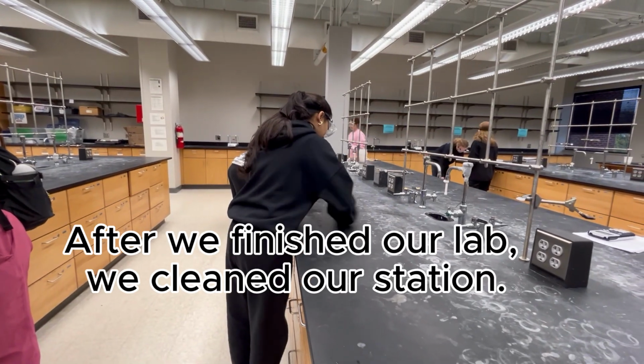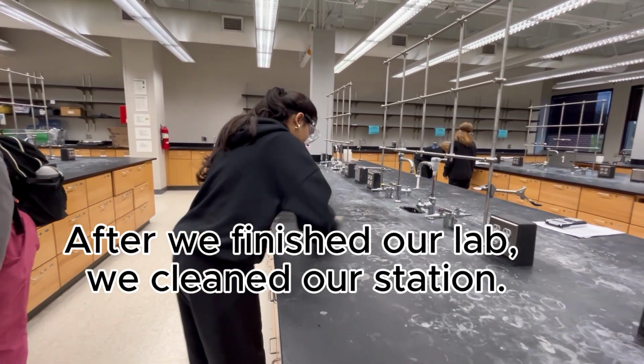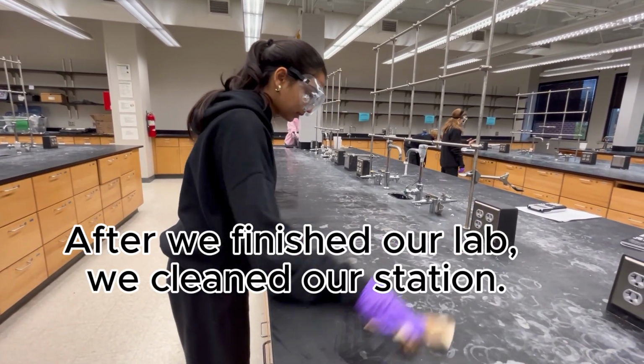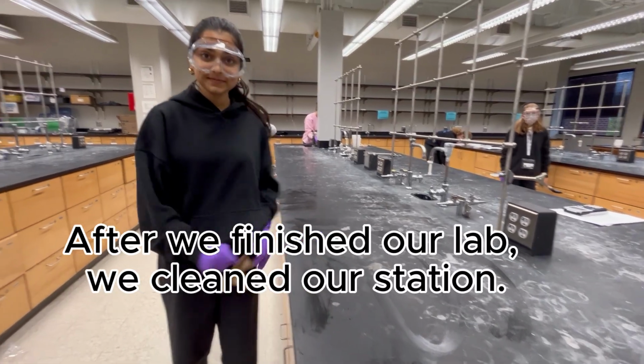After we finished our lab, we cleaned up our lab station in this area and in the spectrophotometry analysis room, as well as disposed of all of our materials properly by putting them in designated areas.